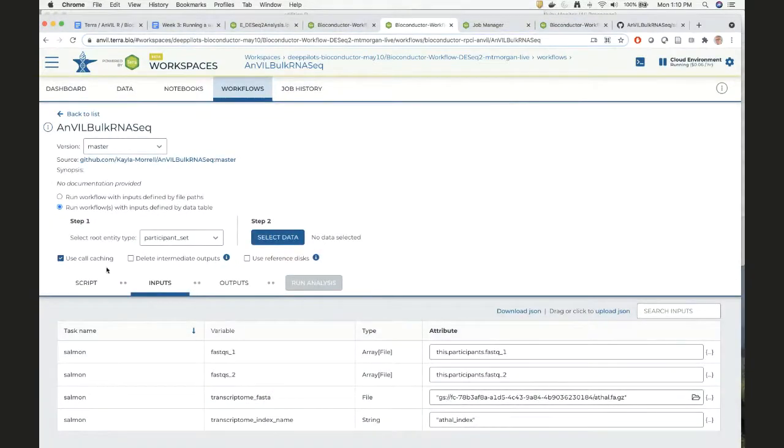So when I was working on the ATAC-seq stuff, to debug, I was just running it on one pair because it takes a really long time to run. So I knew if I could get it running on one pair of samples, then I could scale it up to, I think, 5 or 6. But you can just pick a single pair if you want to just run it on that. But it's not checking the presence of the outputs before it runs. If you choose all 17, it will just run all 17 even if the output files are already present.